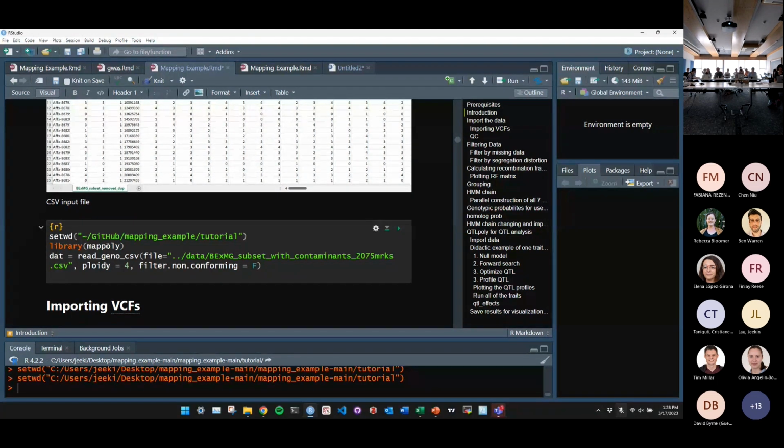All right, I will need you to actually comment out this line, or else it's going to mess up. On this line, get rid of this line, or else it's going to set your working directory to something else. So put a hashtag in front of it to comment it out, or get rid of it. Everybody commented out this line? Okay, if you've commented it out, then you can press play, and it will import the data.